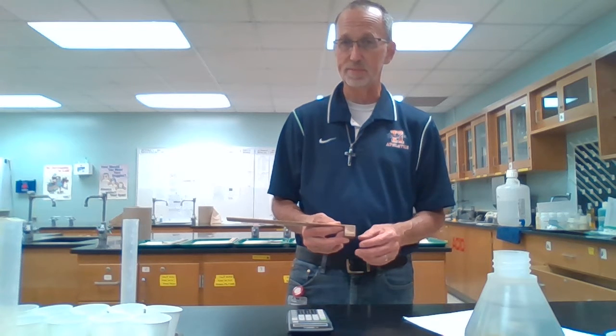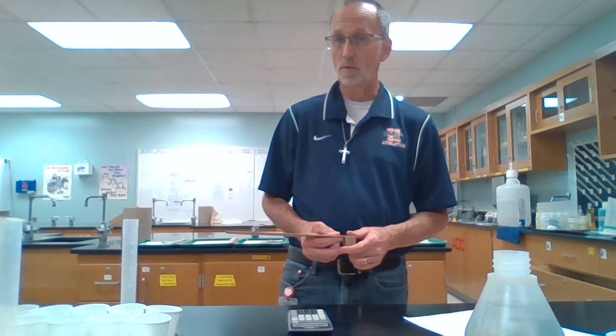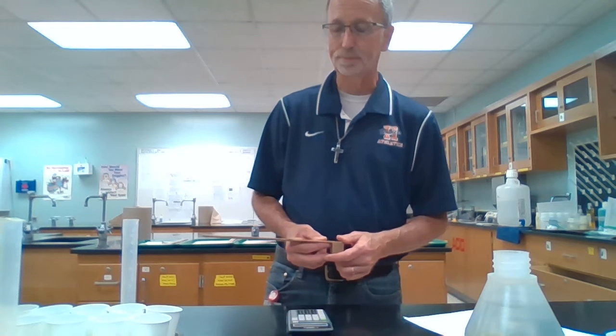Centimeters times centimeters times centimeters, centimeters cubed. Keeping in mind, though, later on that a centimeter cubed and an mL are equal volumes. We talked about that back in a previous lab activity where you graphed centimeters cubed versus mLs, and we found the slope of that line was right around 1.